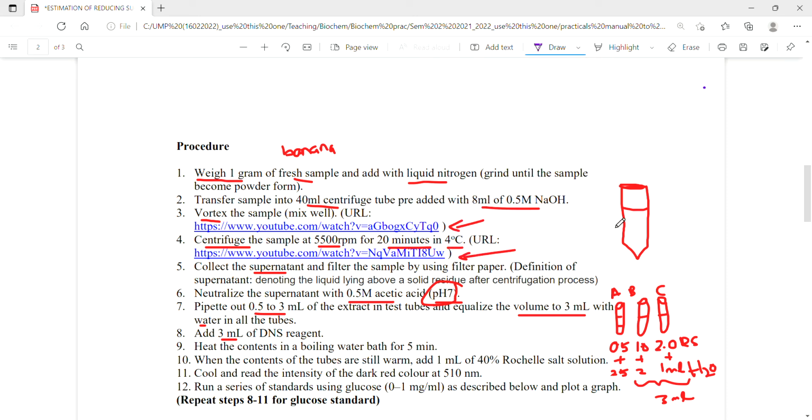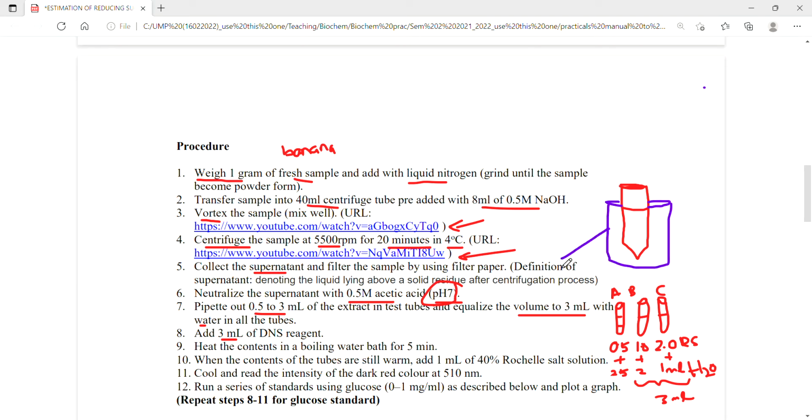Say I put this into a beaker that has water, and then I place it on what is known as a hot plate.